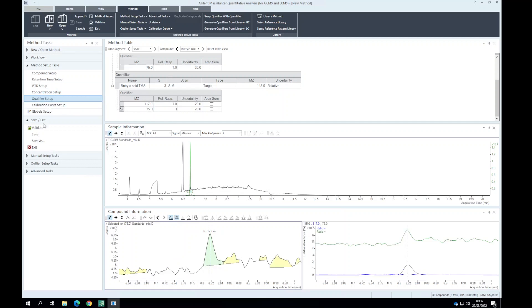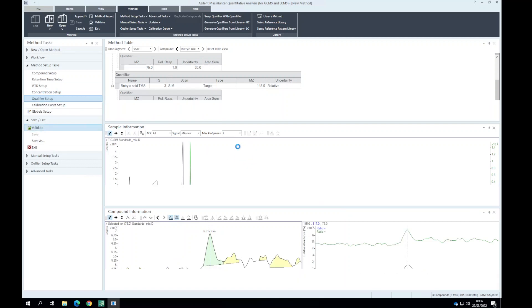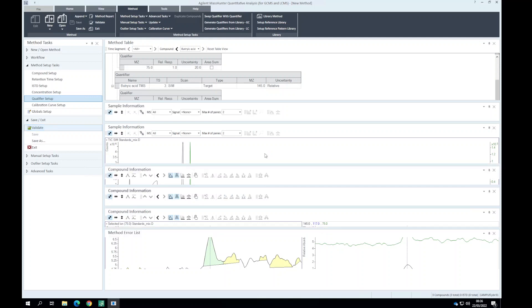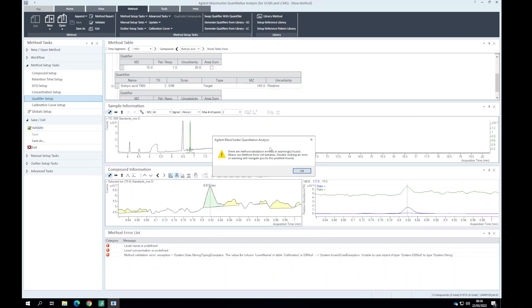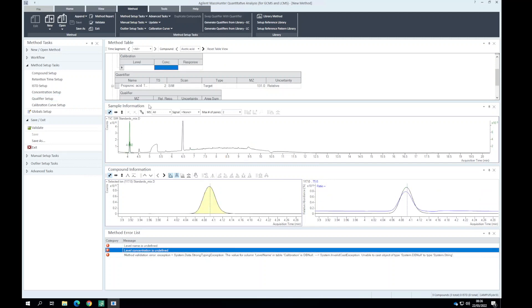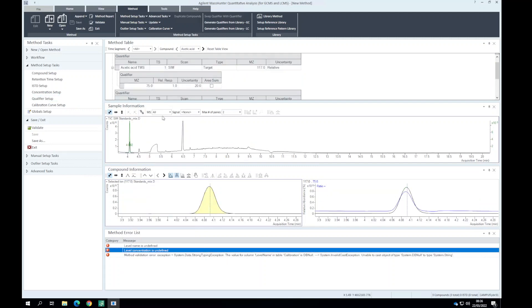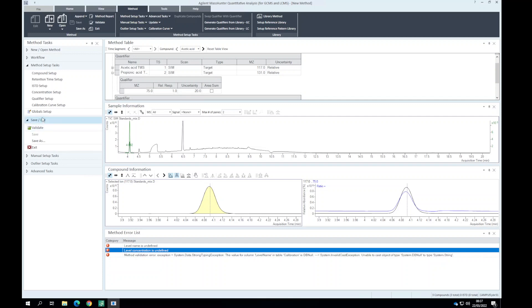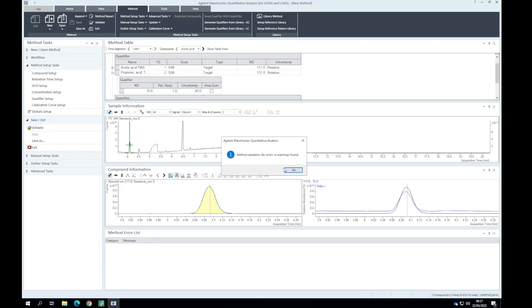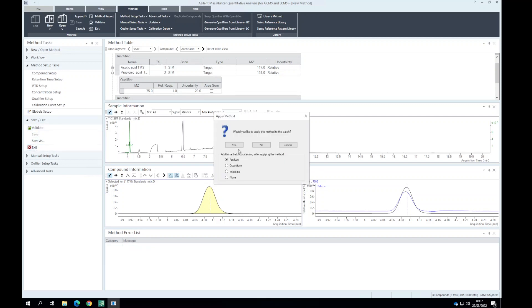Let's validate this method to see if there's any errors. It looks like there is an error, probably because I've added a concentration level. We can just delete this concentration level, validate it again, and then we can analyze the batch.